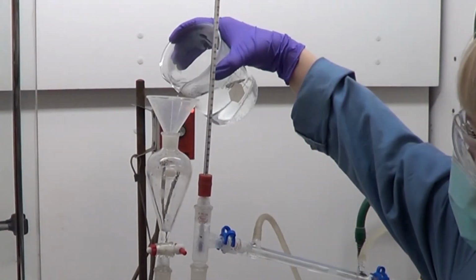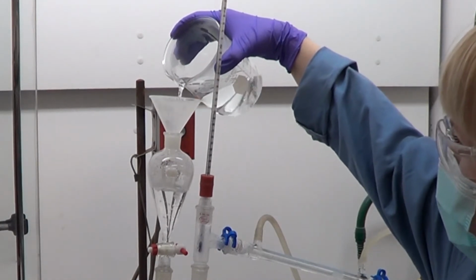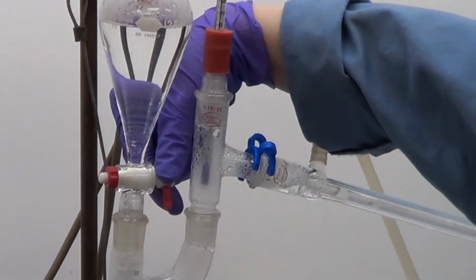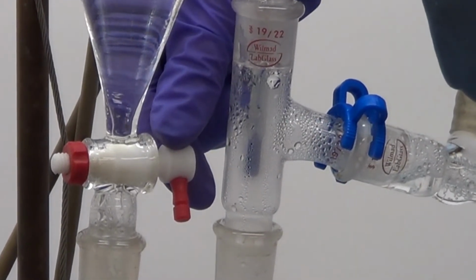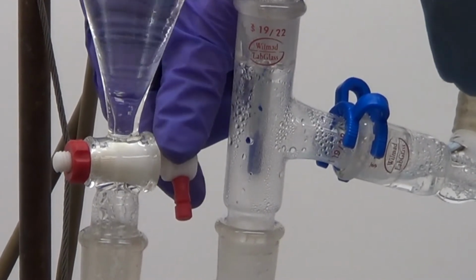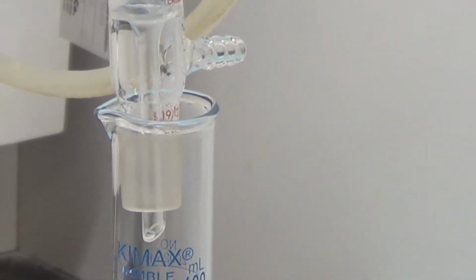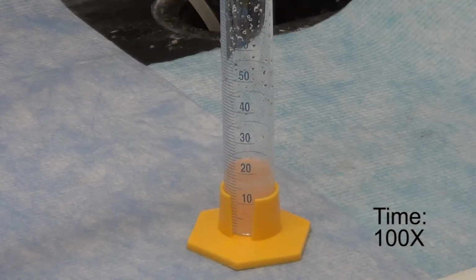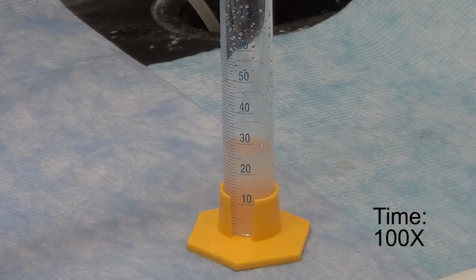As the solution is being heated, hot water is added to the separatory funnel and the stopcock is opened. This will replenish the water that is being distilled and prevent the caraway seeds or spearmint leaves from burning. Be sure to record the temperature of every 10 milliliters of distillate being collected. The water that is being collected in the graduated cylinder should be cloudy. This is due to the carvone that is being co-distilled over the water.